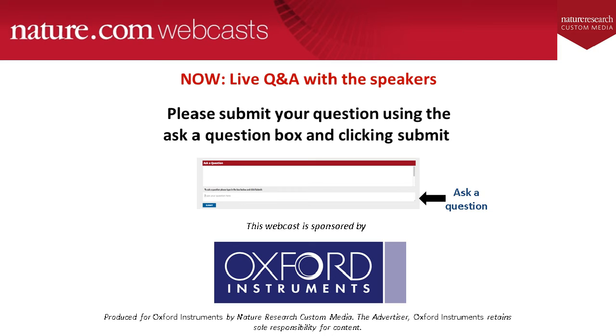Our first question, this one is for you, Louise, and it asks, what was the advantage of using the Ultim Extreme Detector on biological samples? Thank you for that. The Ultim Extreme Detector has two main advantages that I can see. First off, it is able to detect much lighter elements. In particular, nitrogen really comes out clearly with the Extreme Detector, as I think you'll have seen on one of my earlier slides. The second one is that you can use a much lower voltage from your electron beam.